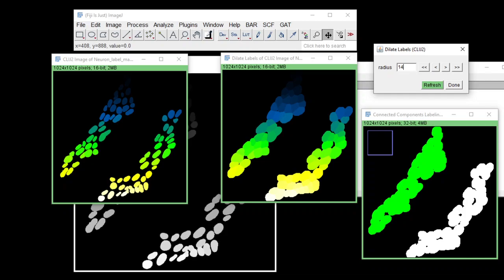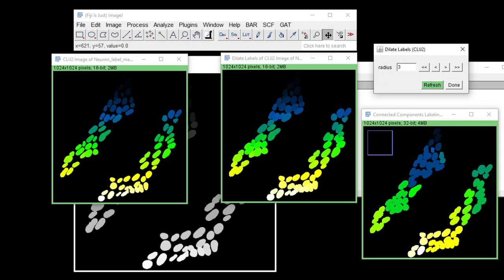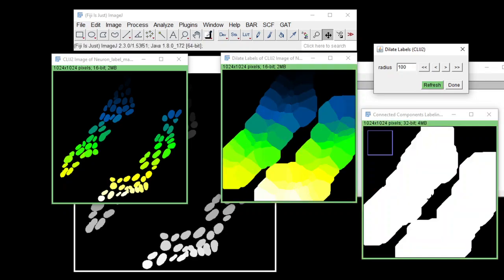Now, the issue which you can probably foresee is that it is very dependent on the distance you define. Here I'm defining it in pixels, but just to illustrate the point, if you define a much smaller distance, I will get distinct ganglia here. So I probably have around 10 ganglia here, and this will only capture the cells that are really close together. If I go really large, it'll capture cells which are really far apart, and you can see it's formed one massive ganglion here. So this is the bit that will need optimization, figuring out what value works for you.